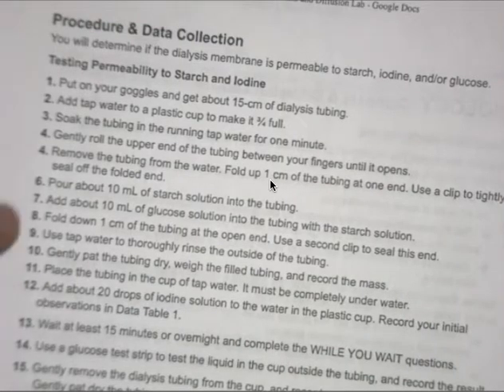Number 8, fold down 1 centimeter of the tubing at the open end. Use a second clip to seal this end. Number 9, use tap water to thoroughly rinse the outside of the tubing. 10, gently pat the tubing dry. Weigh the filled tubing and record the mass. 11, place the tubing in the cup of tap water. It must be completely underwater.